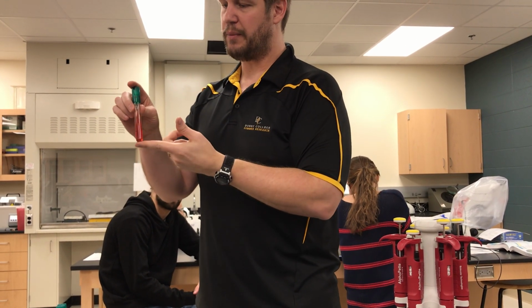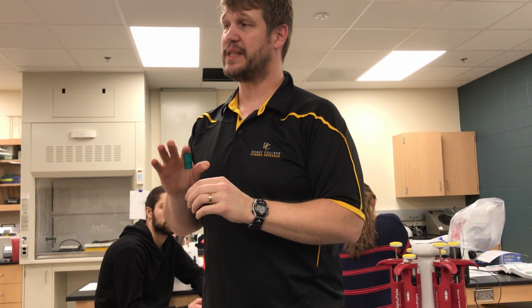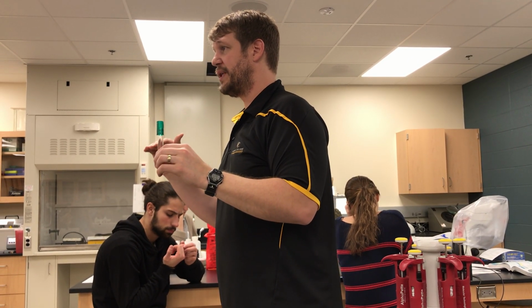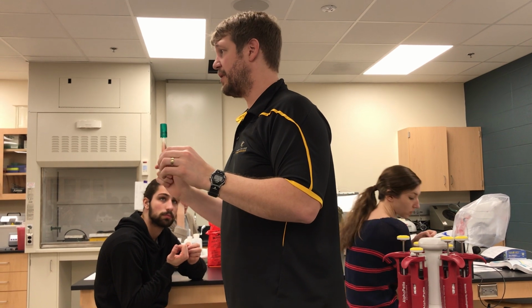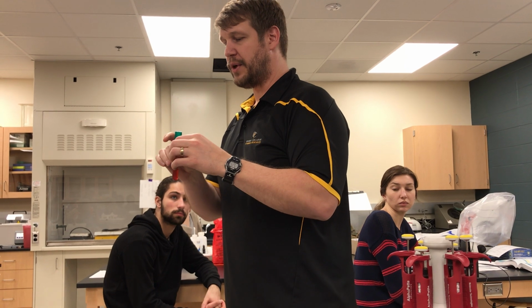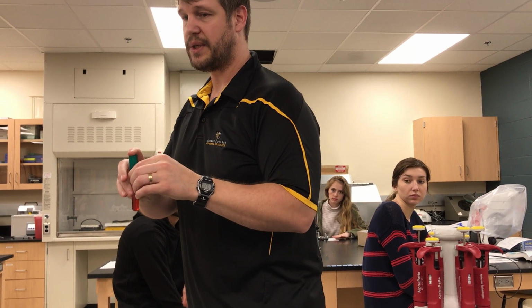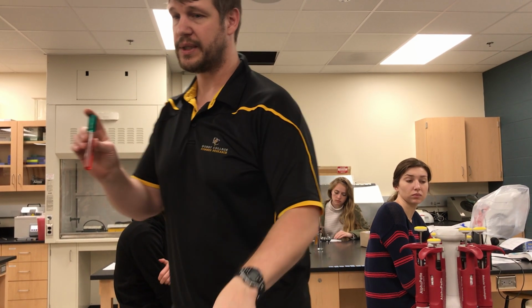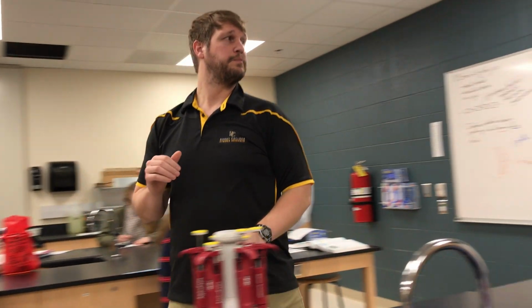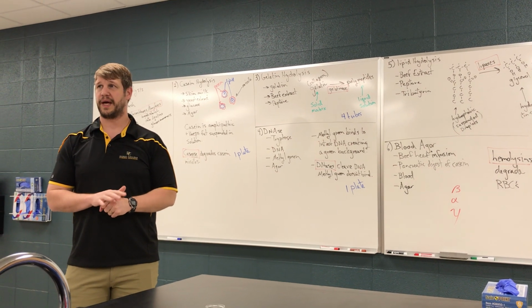Okay. The important thing to remember, as I said, you have this glucose to lactose transition, which means it's kind of important to catch it at particular time points. It is time sensitive in a way that most of your other media hasn't been. So you may actually want to look at it several times over the course of the next 48 hours. Any questions about that?